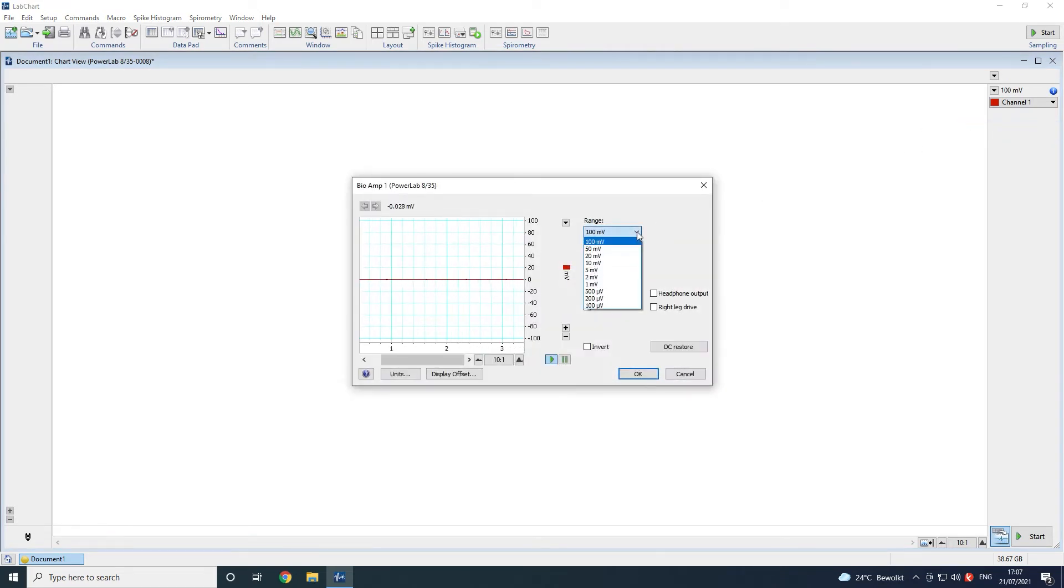In this dialog you can set up the range of the input signal, the required low pass or high pass filters, the mains filter if mains noise is present, and invert the signal if needed.